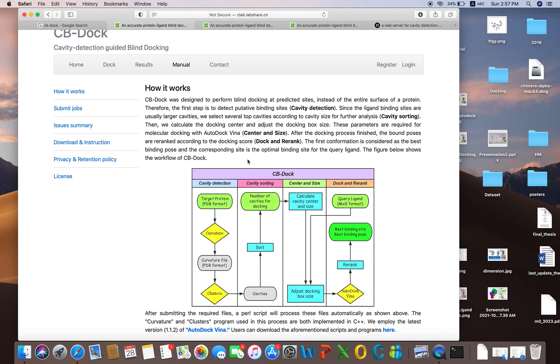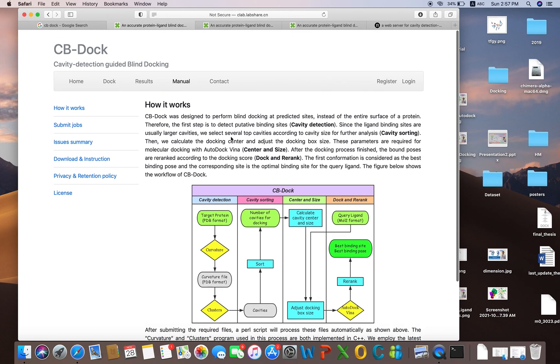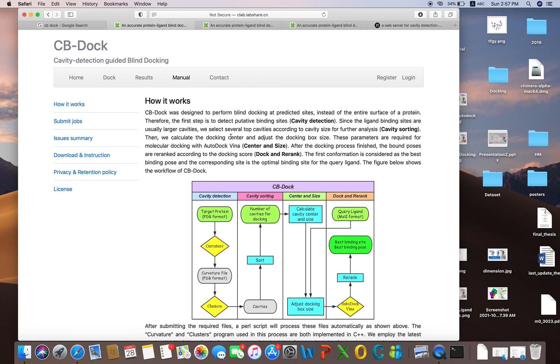You do not need to worry about all these things. It is an automated program and server — it will do all these things automatically. It is a very easy program.